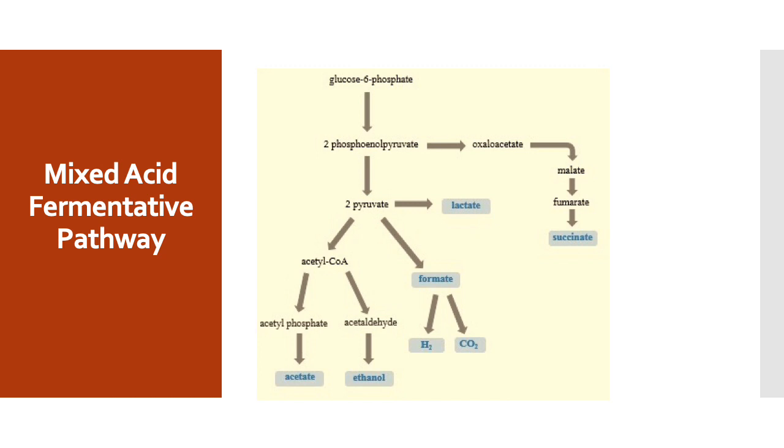Ethanol formation is established using the enzyme alcohol dehydrogenase, which catalyzes the reaction from acetyl-CoA to ethanol. Succinate formation starts with the carboxylation of phosphoenolpyruvate to oxaloacetate by the enzyme phosphoenolpyruvate carboxylase, and is subsequently achieved via the activity of three different enzymes, namely malate dehydrogenase, fumarase and fumarate reductase.